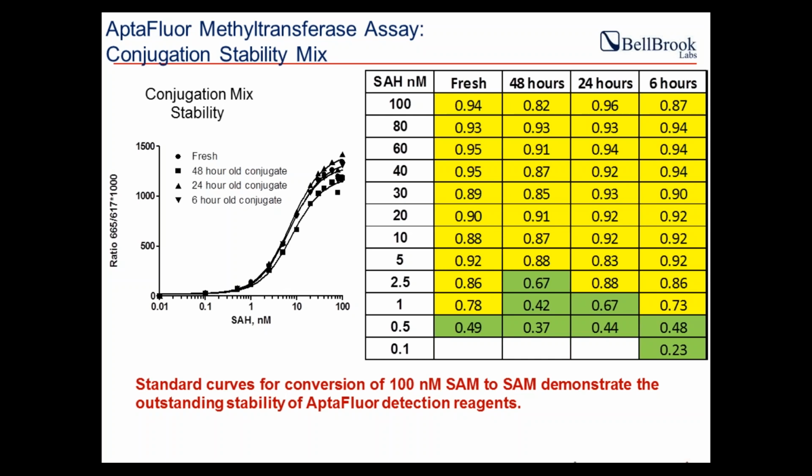You need to either avoid RNases and treat reagents with DEPC. And even though we started doing all that, we realized as we kept working that all we had to do was use nanopure water, nuclease-free water, and that's the only precautionary thing that I use to work with RNA. I have found that these RNA pieces are extremely stable, and probably once they form the secondary structure, they become really stable and they cannot be degraded.